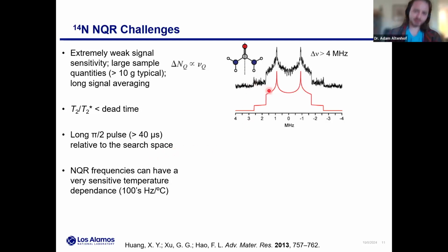So here is another example of a high field powder spectrum. In this case, this is urea. This is about 4 megahertz broad. And what's interesting about this is that we know the 14N Larmor frequency, so we know to tune our probe here. And if you were to measure for long enough, you probably will eventually see some blob in the middle. And then really it's just a matter of if you perhaps sweep the field or sweep the frequency, you could actually trace out this powder spectrum.